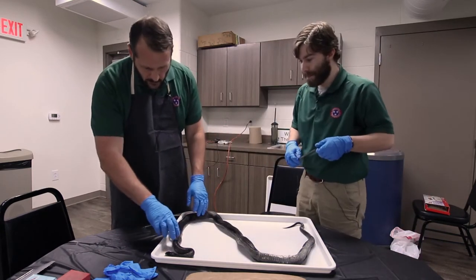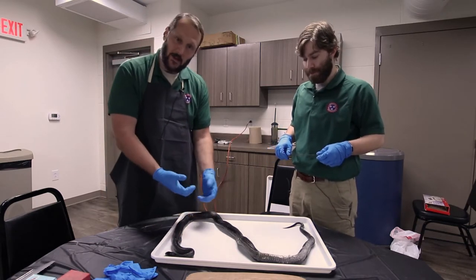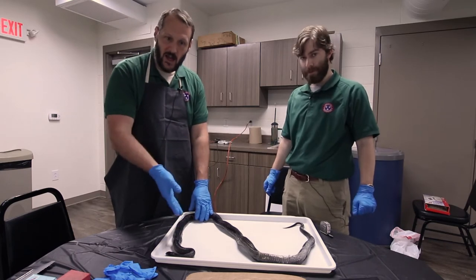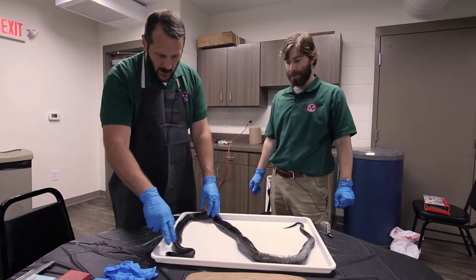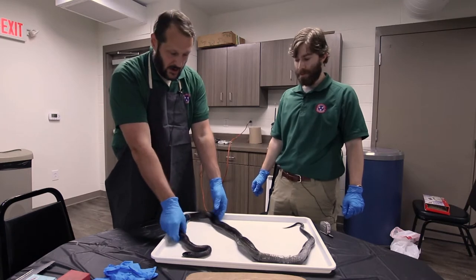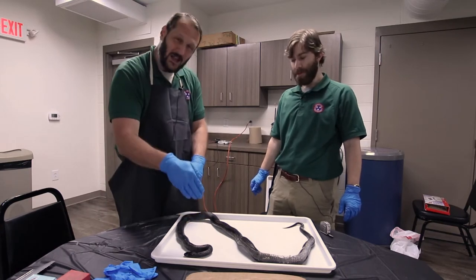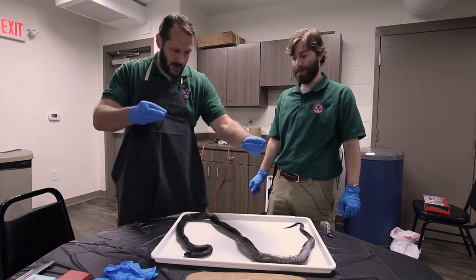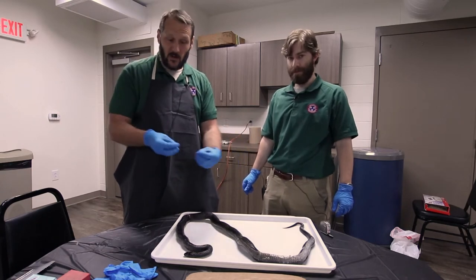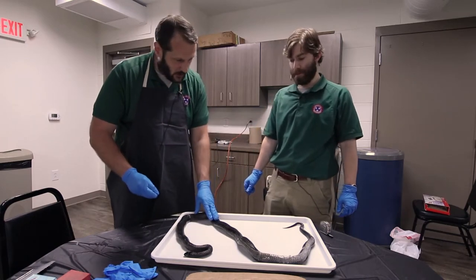While we're getting ready to measure this guy, let's make some general observations about the external anatomy. There are a lot of things that snakes have in common with us mammals. They breathe oxygen, they breathe through lungs, they have paired eyes and nostrils, they have a heart, they have a liver. But of course, snakes are different in some key ways as well. One of the things we're going to see is, I'm guessing, a great elongation of some of the organs, because they're fitting all the same organs that you and I have into a much narrower but much longer space. So some of the organs might be longer than you'd expect, but they're all going to show adaptations for being compact inside the smaller space.